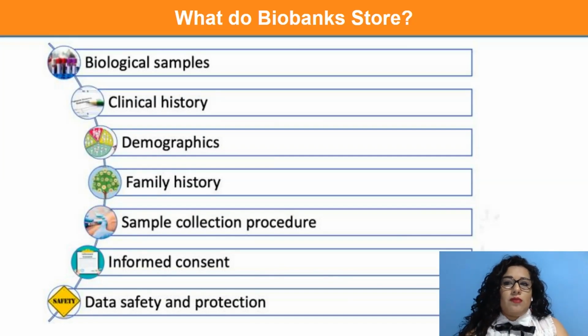The goal of the informed consent is to enable competent individuals to decide for themselves whether to participate in research or not. Also, biobanks are responsible for managing data safety and protection to be able to share information adhering to international standards and compliances.